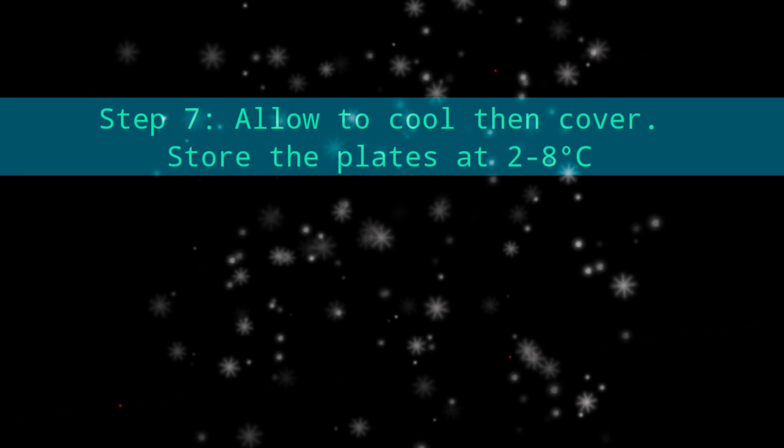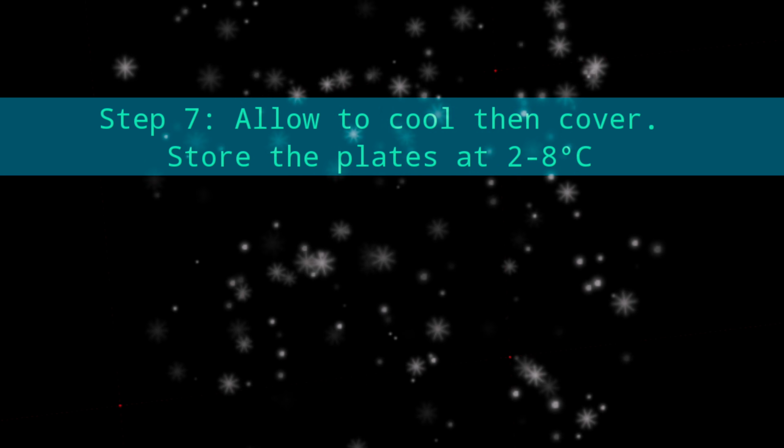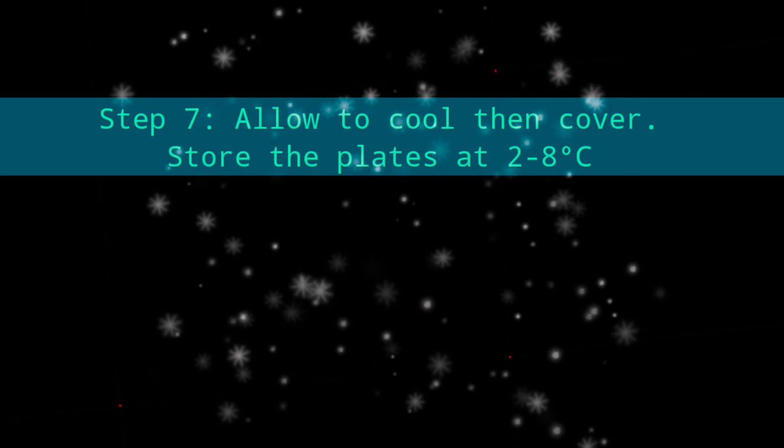Last step is to allow it to cool, then cover, then store the plates at 2 to 8 degrees Celsius.